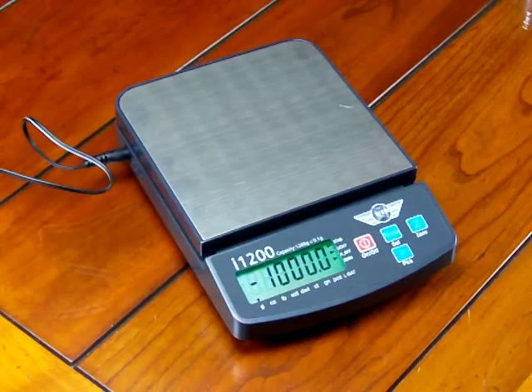If I take off the one kilogram weight, you'll see I have a negative number. To correct that, all I do is hit the zero key.